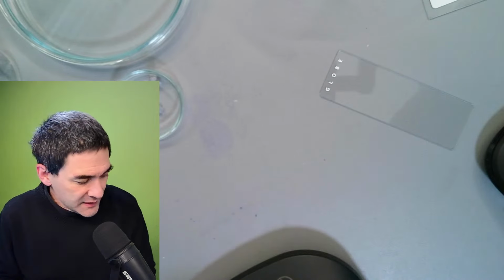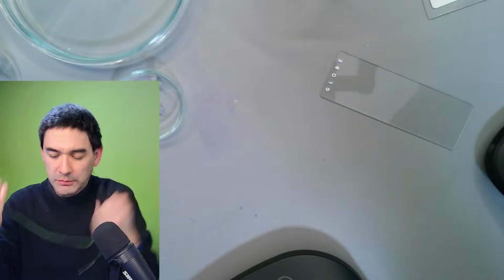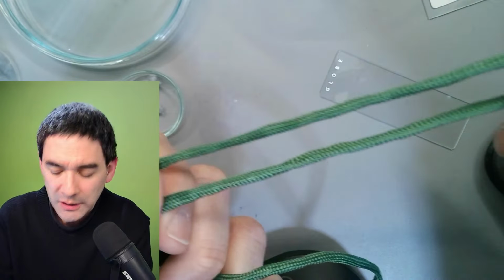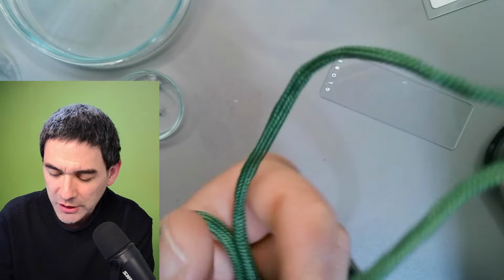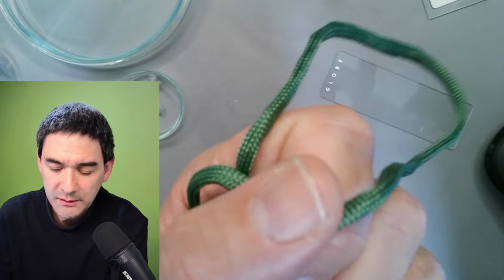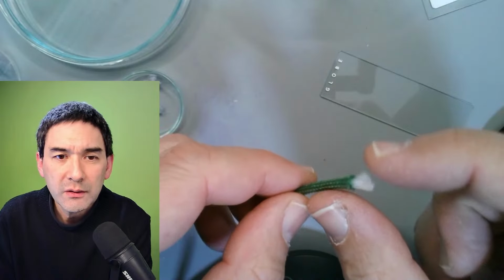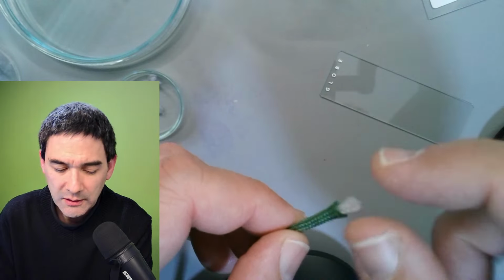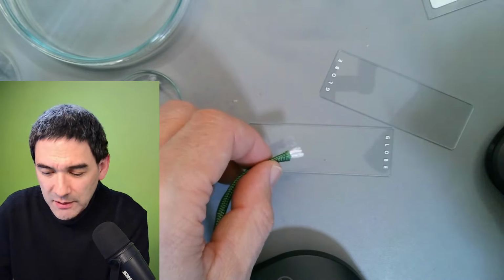And now the next thing is the following. I don't know if you know what this cord is. I can show it to you here. This is called paracord. Some people actually use it to make arm bands and things like this. If you just look over here, it looks like this. These things look very, very synthetic, which is actually a nice specimen.